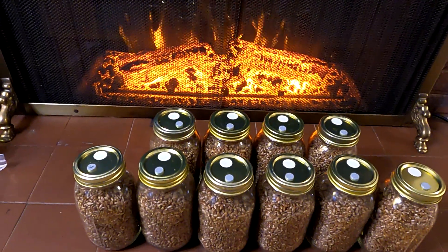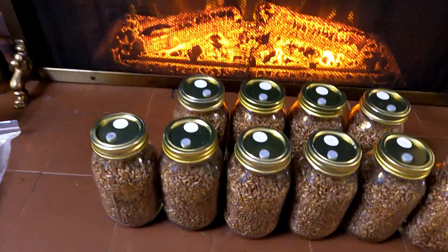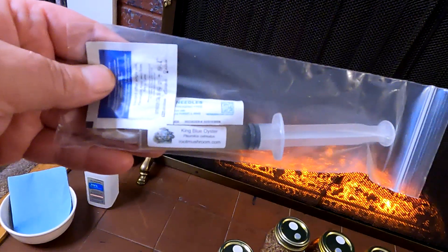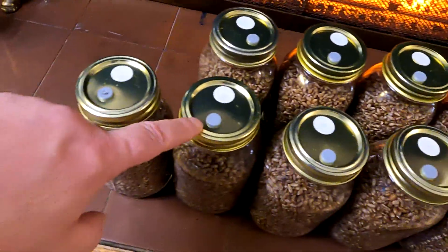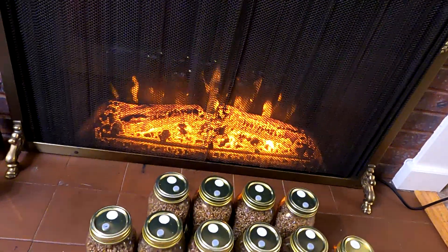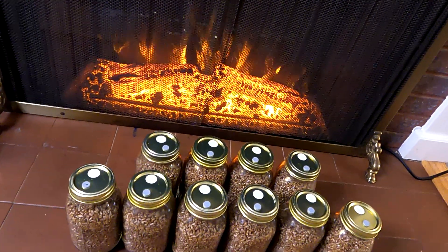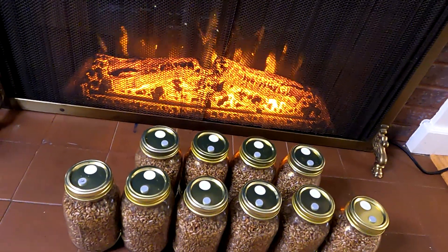Although there are many ways to accomplish this task, I've opted to begin by inoculating my substrate, which is a rye berry grain, with some liquid mushroom culture. We're going to accomplish this by simply injecting through these self-healing injection ports on these jars about one to two CCs or milliliters of the liquid per jar. That one syringe is going to inoculate all of these quart-sized jars — a total of 10.